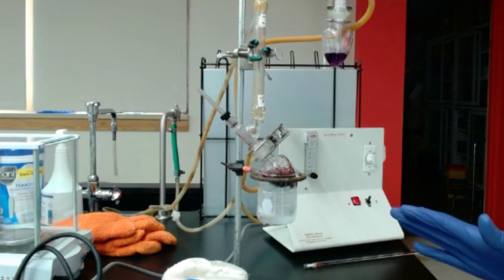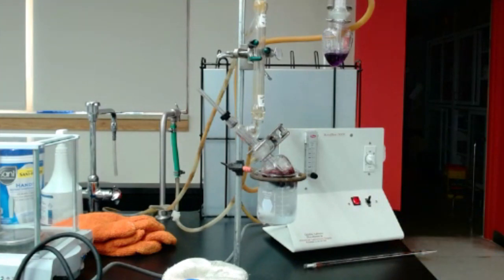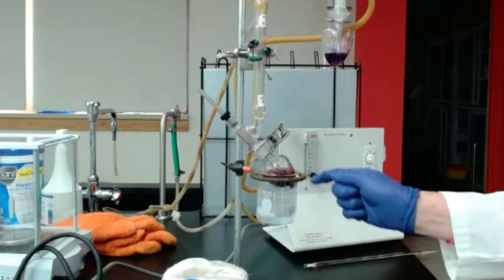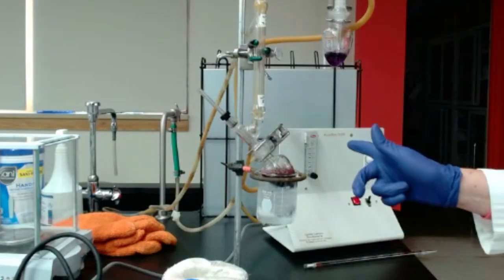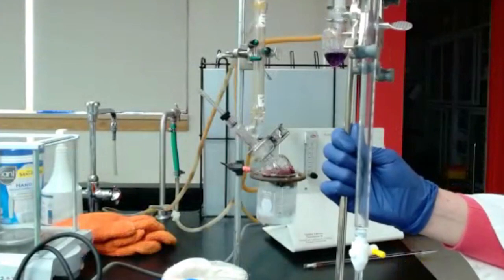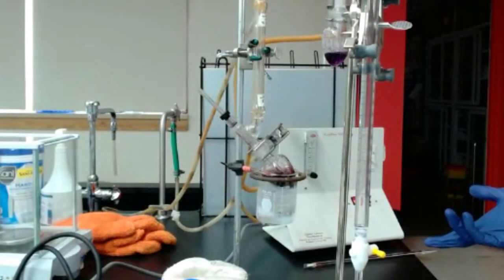So we're going to wait 15 minutes before doing the titration of free SO2. So that's really free SO2 we are doing right now. While it's running, because we have 15 minutes to wait.